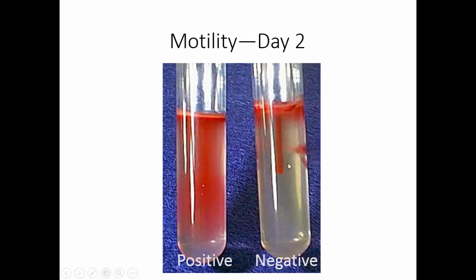So you want to look here at the tip of the stab line. Nice and clean and sharp, no movement. Over here, very fuzzy.